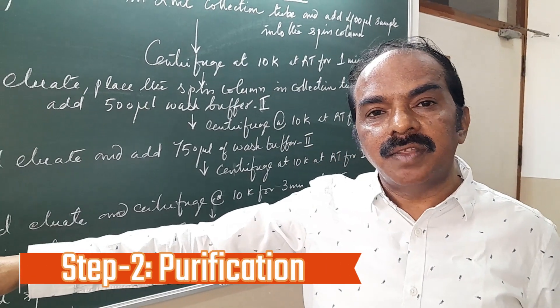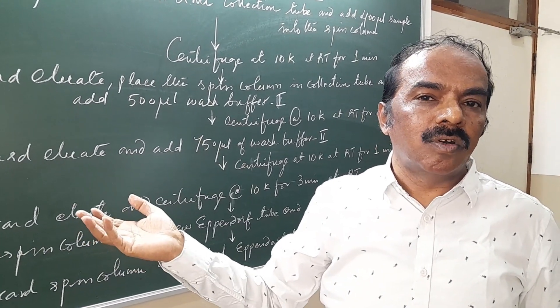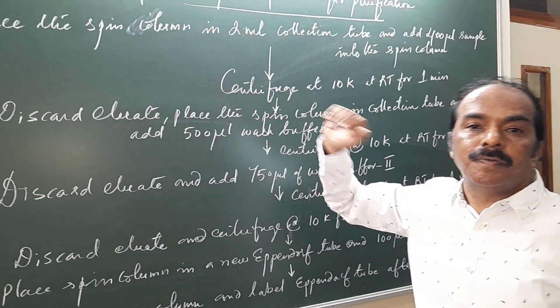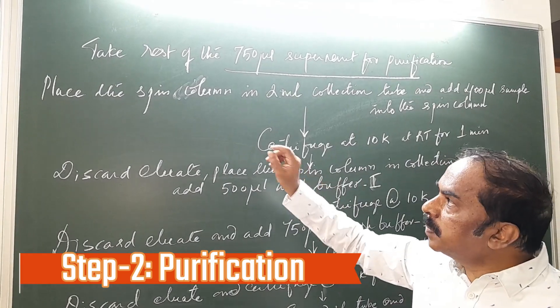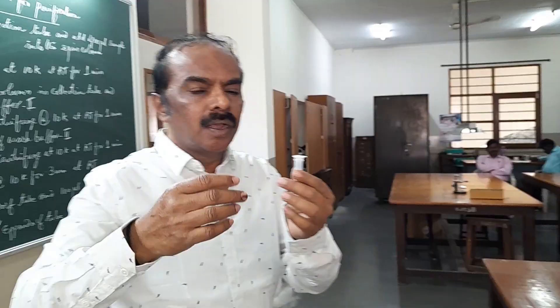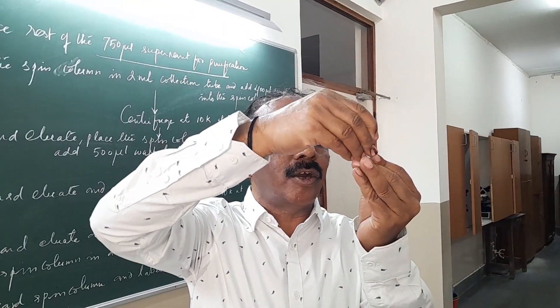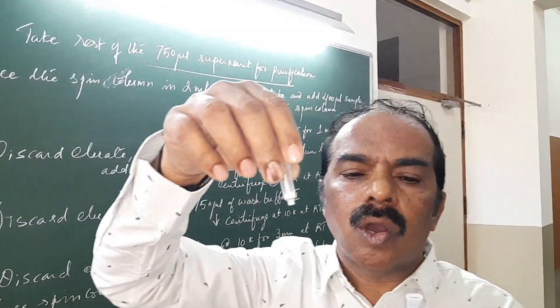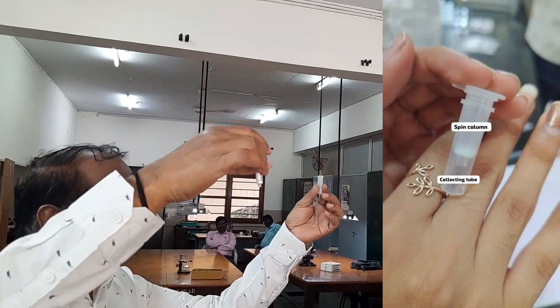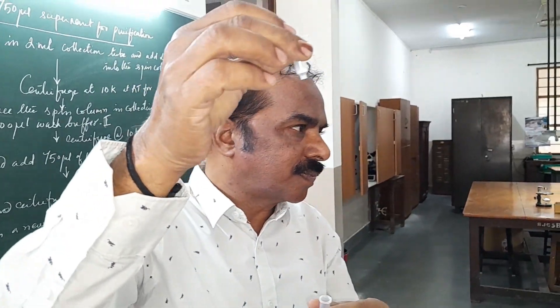The 100 µL we used in the first step was for the crude sample. The remaining supernatant we are now using for purification of plasmid DNA. Take the DNA sample in a spin column and keep it in the collection tube. There are two components: the spin column and the collection tube. We are adding the sample into the spin column.